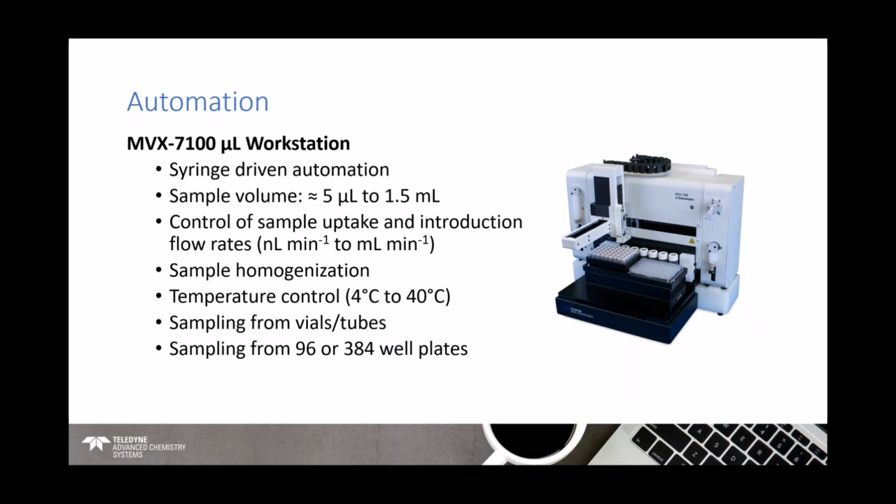Typically for ICP-MS, you would use a peristaltic pump where you are using the peristaltic process to introduce some liquid samples through tubing to a nebulizer. That is not as appropriate for this kind of work, unfortunately. The cells aren't going to respond very well to that kind of pressure, that kind of pressing that goes through the pumping process. So a syringe-driven approach is more appropriate here.